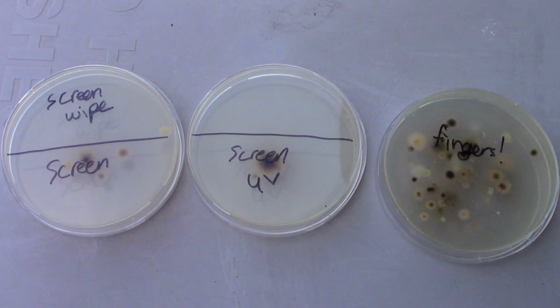And then we'll take a closer look, but just from observation at this angle, screen wipe has a couple of tiny dots. The screen doesn't look pretty, and the screen with UV doesn't look a whole lot better. I wish I had gotten better pictures. I guess I was just really focusing on the super gross parts. But if you look on the left, the screen has multiple different kinds of bacteria, mold, fungi, whatever colonies. And the screen UV one, I think it just has a couple, but one is really big. So I think that's why it looks comparably worse. But either way, it doesn't really compare to the screen wipe.